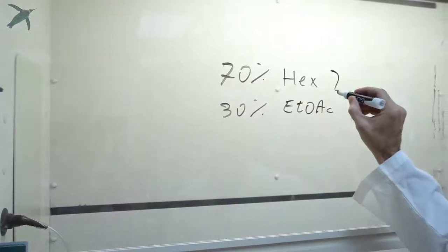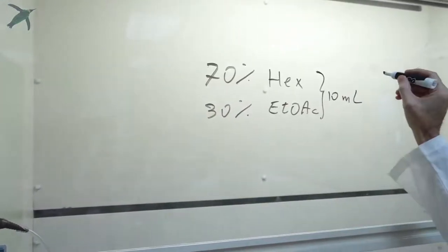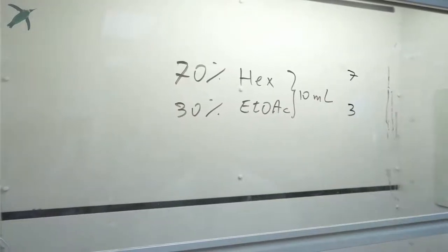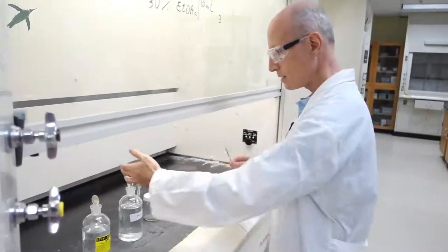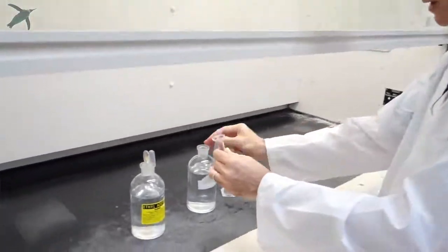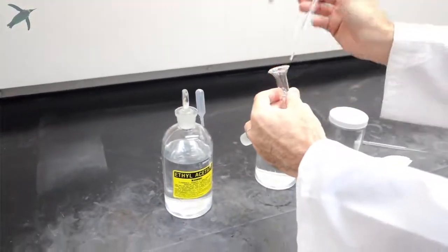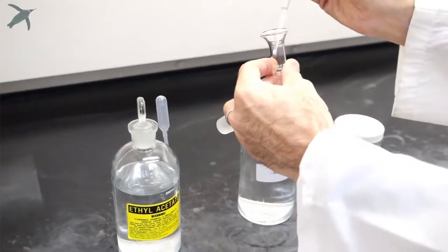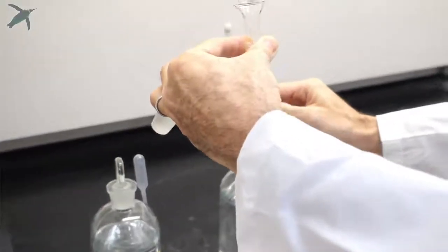You want to make 10 mLs, so this is 7 mLs of hexane and 3 mLs of ethyl acetate. With your 10 mLs graduated cylinder, you go to the hexane bottle and take your 7 mLs. This needs to be fairly precise, so you want to be at 7 mLs.